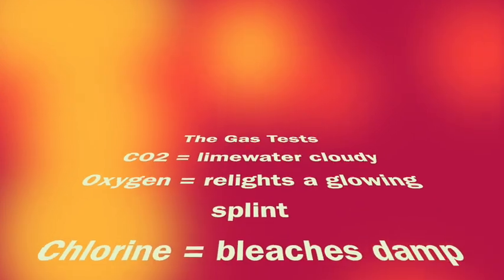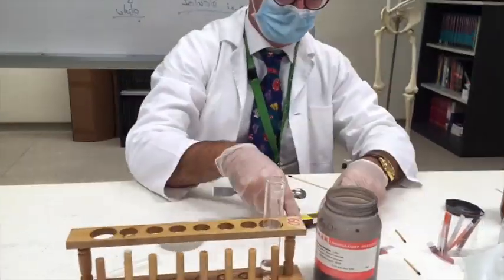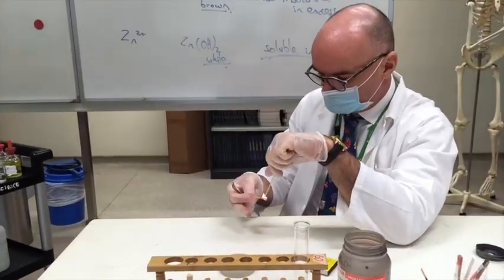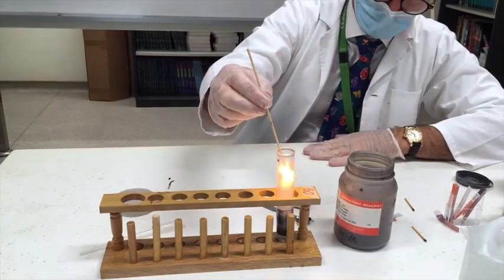Finally, we have the gas tests. You can see them on the screen. Learn it, deal with it, move on with your lives. I thought I would include oxygen because it's quite beautiful. Relighting the glowing splint. Look at that.